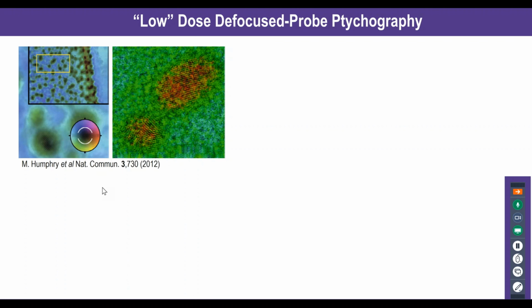And then you collect those diffraction patterns and reconstruct these images. For more information, just go to this reference. It's a very nice paper, and really fundamental on this defocus probe ptychography.